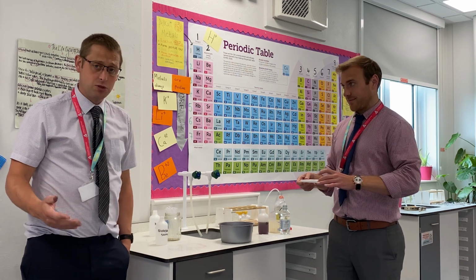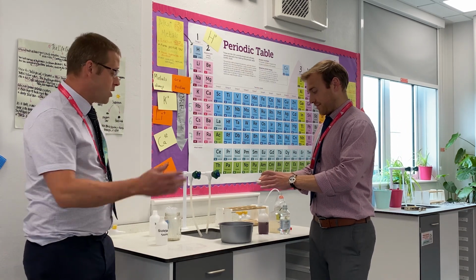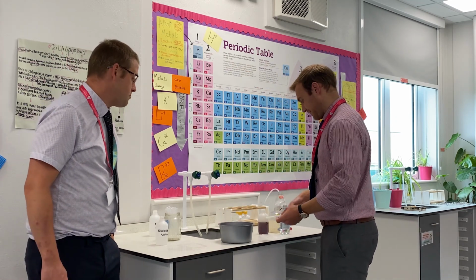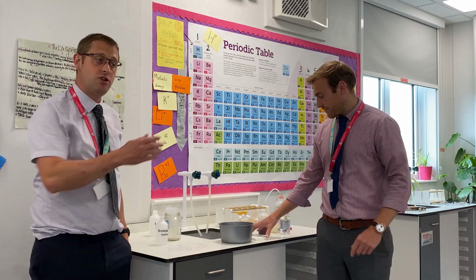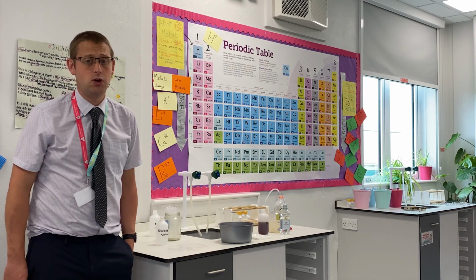Today it's really important that you get rid of the chemicals properly and don't spill them. There is a grey bucket at the front of the class. If you come up one by one and pour the dimple tray into that grey bucket, and then place the pipettes inside the grey bucket as well, with the dimple trays on the side. If you then go back to your seats, if there's any spills that you need to wipe up, please use some blue paper, and then it's time to wash your hands.